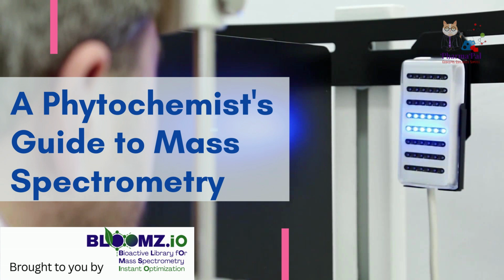Okay, but here's where I think it gets really interesting, especially for someone trying to optimize this. You have weights, but how do you figure out what the molecule actually is, particularly if it might be something completely new? Right, that's the key challenge and where the real power lies. This is where we get into things like tandem mass spectrometry, or MS/MS. You select ions of a specific weight, your potential bioactive compound, and then you basically break them apart inside the instrument.